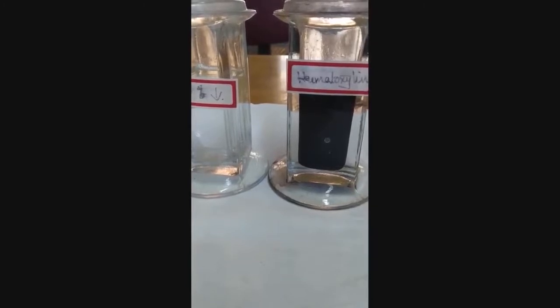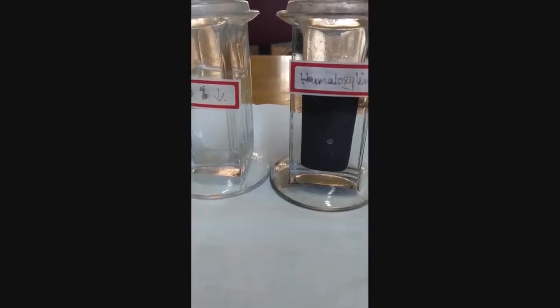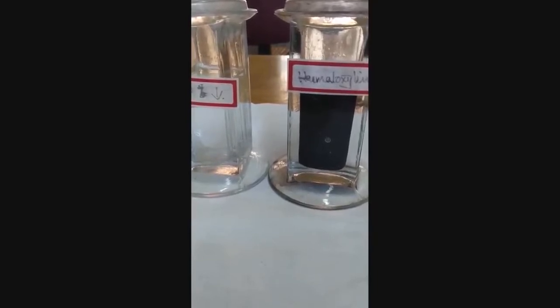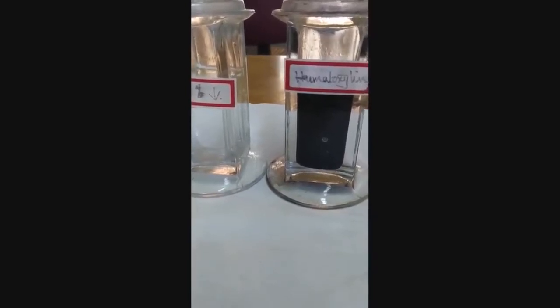It reacts with acidic components of the cells. For example, nucleic acids are acidic. Thus, hematoxylin is a nuclear stain and stains the nucleus and its components. We have to keep the slide in hematoxylin for about 5 minutes.